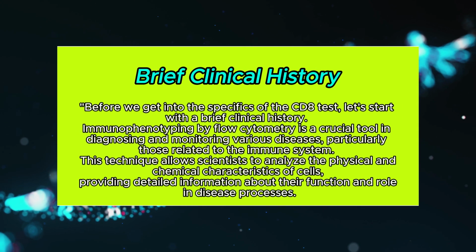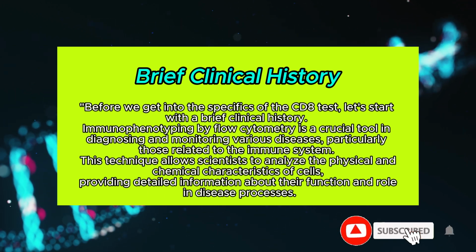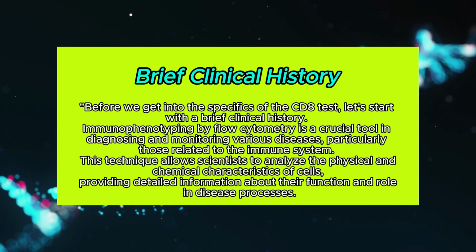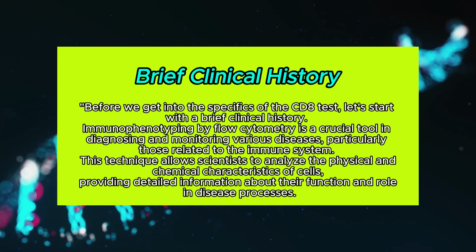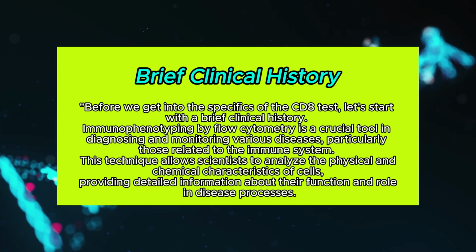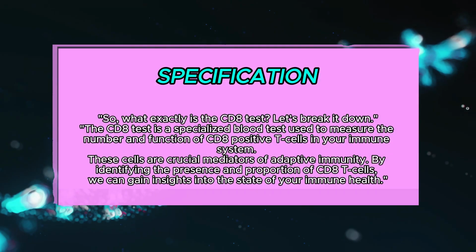Brief clinical history. Before we get into the specifics of the CD8 test, let's start with a brief clinical history. Immunophenotyping by flow cytometry is a crucial tool in diagnosing and monitoring various diseases, particularly those related to the immune system. This technique allows scientists to analyze the physical and chemical characteristics of cells, providing detailed information about their function and role in disease processes.